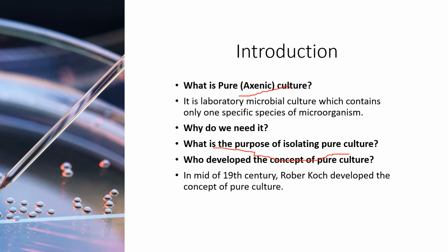After obtaining pure culture, it is tested, verified, and characterized in order to confirm the origin of microbial species. Isolation of pure culture has application in various fields such as molecular biology, bioprocess technology, clinical studies, pathological and agriculture field, etc.